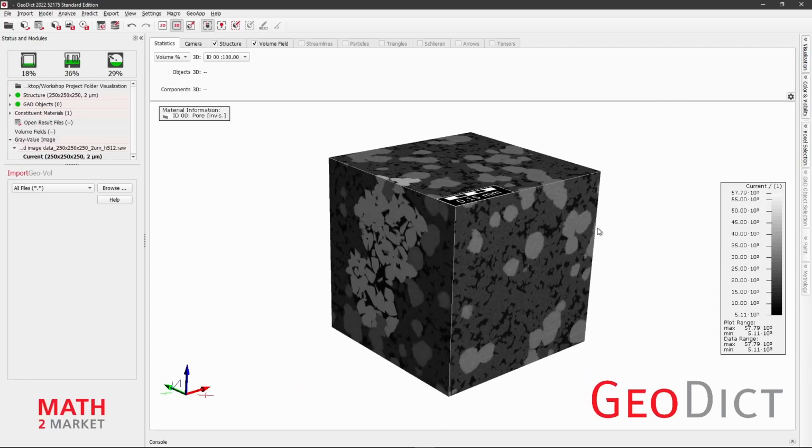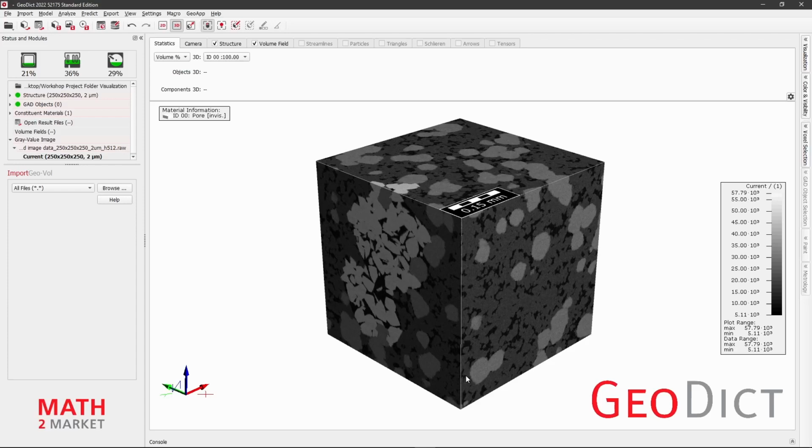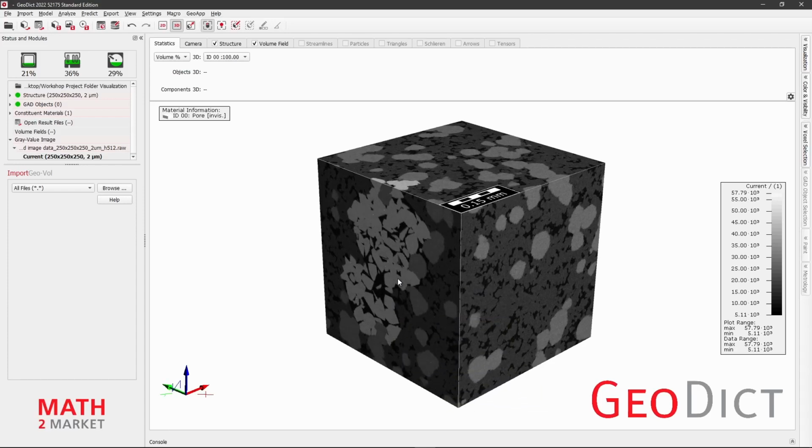I recommend a camera position that shows 3 sides of our dataset as evenly as possible. If you can already identify an interesting region like this, it should be visible. We can also adjust the position, zoom and rotation in the camera tab of the visualization panel.